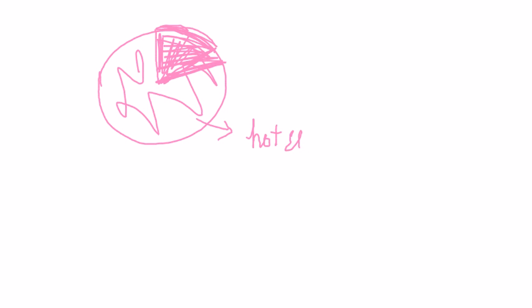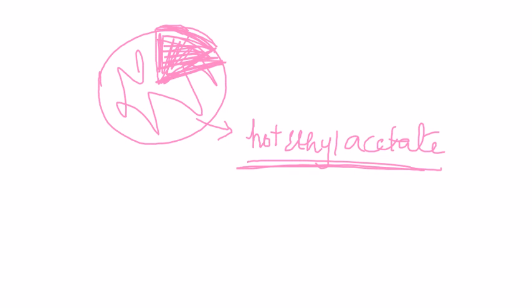So what I want you to do at that point is collect all of your material and dissolve that in hot ethyl acetate. This has to be a minimal amount of ethyl acetate. Recall from recrystallization, if you add too much ethyl acetate, it's not going to come out. So no more than 2 milliliters.